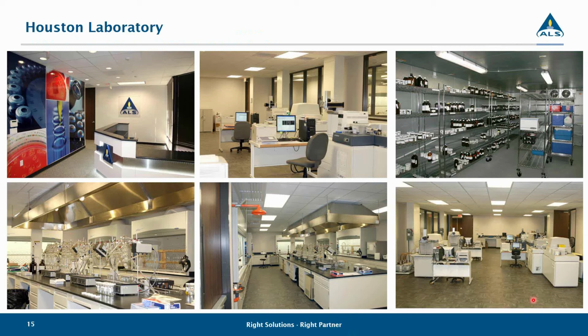Catherine, if that didn't answer your question, let us know. We have a question from Lori. If standards recovery falls outside recommended ranges, how do you know your results are still accurate? Would there not be a considerable plus or minus margin around the results? That data would have a Y qualifier indicating that the labeled standards fall outside the expected range, and sometimes one or two are outliers and fall outside of the quality range.